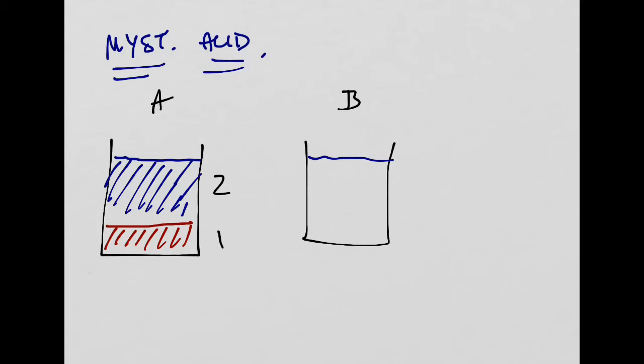In my second scenario, I'm going to have a 1-to-1 ratio. One thing I want you to pick up on here, which is important, is that we have the same amount of overall volume in both of these cases. It's just been divided differently. Okay, so the same overall amount.